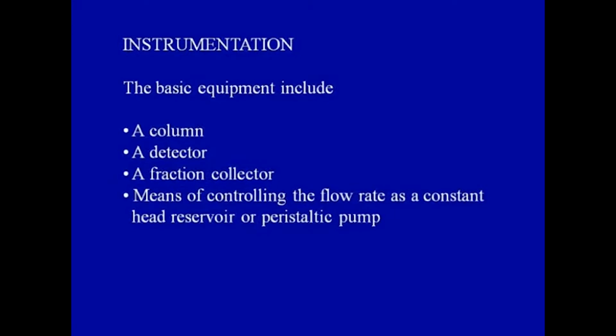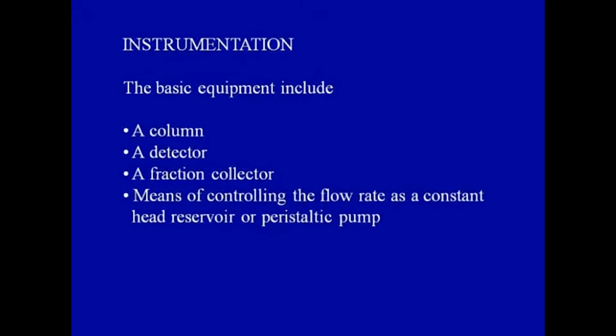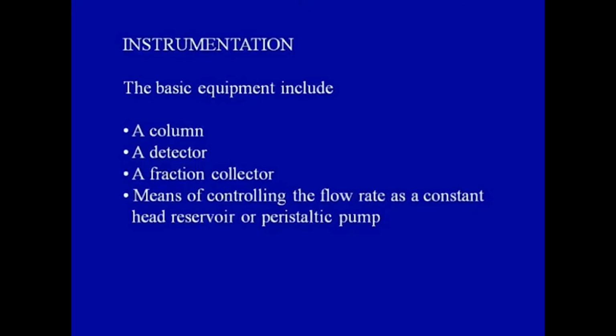You require a detector so that you can see the peaks coming and watch the purification visually. Then you require a fraction collector to collect those fractions or different peaks separately. Then the flow rate has to be controlled. You can have a constant head reservoir, but that is not very suitable. What you require is a pumping system. It could be a peristaltic pump for low pressure, or for high pressure it could be a constant displacement or other pump.